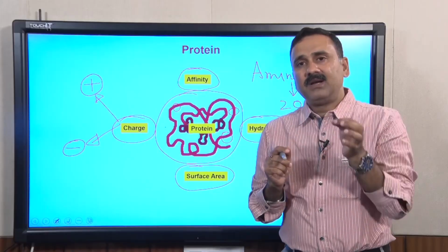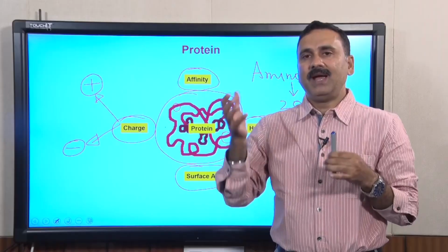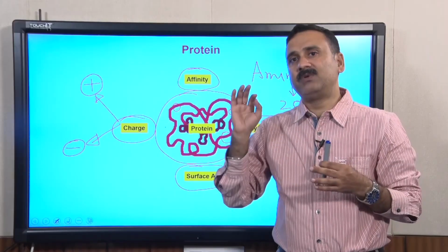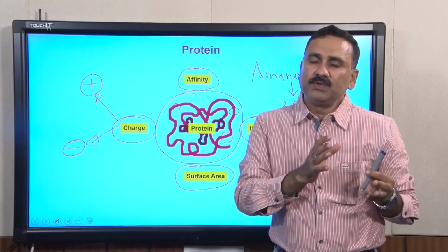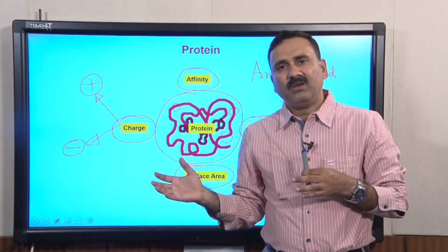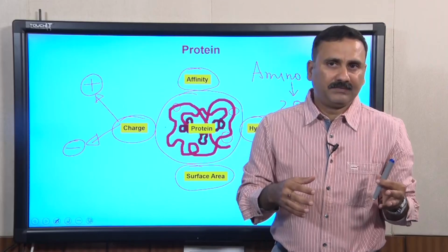So, the single stranded DNA binding protein has a charge distribution as well as another kind of amino acid distribution in such a way that it has a very high specificity for DNA. That is why if you use DNA as a ligand, you could purify the single stranded DNA binding protein from the crude lysate.